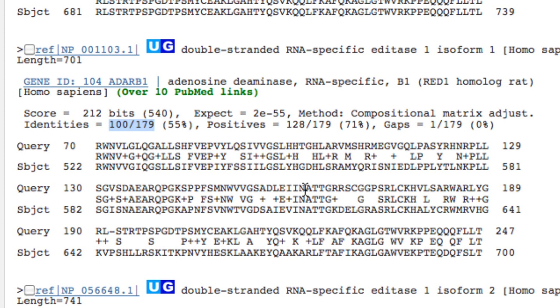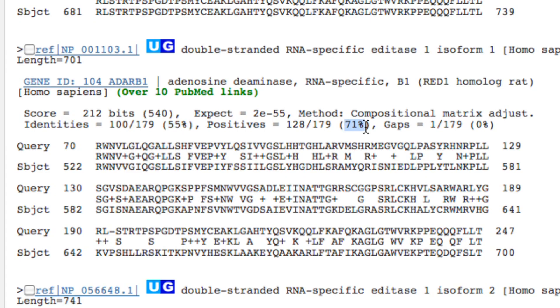In addition, there are some amino acids with plus signs. For instance, there's a plus sign between a V and an I. The V is valine, the I is isoleucine — chemically they are very, very similar. So although it's not an exact match, it's very close chemically, and that's considered similar. Under positives it says 128 out of 179, and we know 100 are already identical, so there are 28 more that are similar enough to call a match. I would say these two proteins are 55% identical and 71% similar.